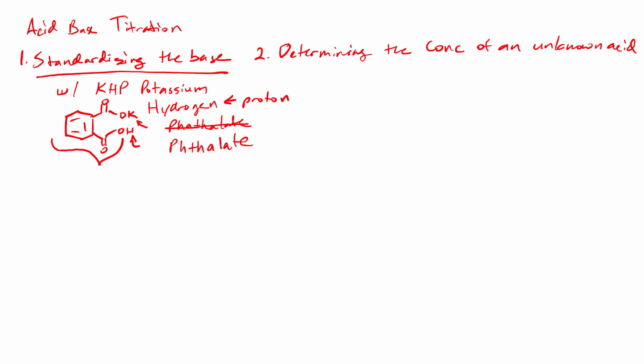Right, it can actually be used just like an acid. It can be given to the base to make a neutralization reaction, where you add acid and base together, you neutralize, and get salt and water, right? The reason we can do that with potassium hydrogen phthalate is because this is one of those acids, quote unquote, that you can weigh out on a scale and figure out its exact mass, and not have to worry about it taking water mass from the atmosphere, right?